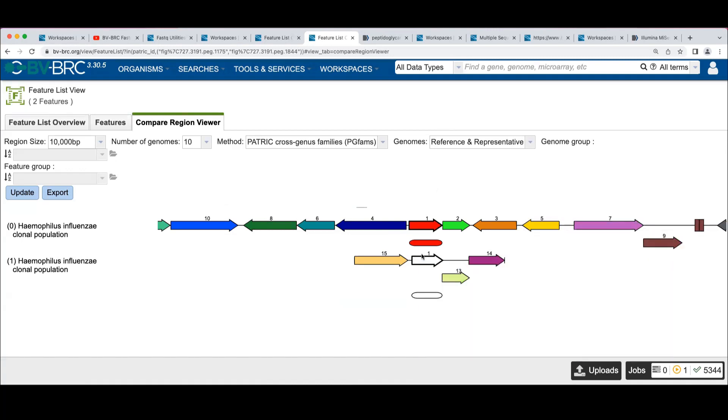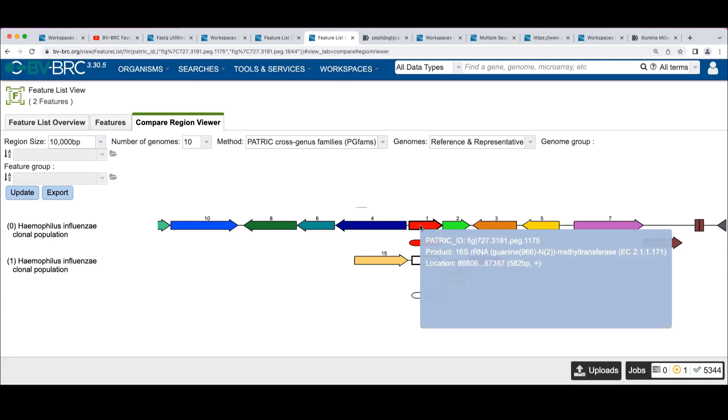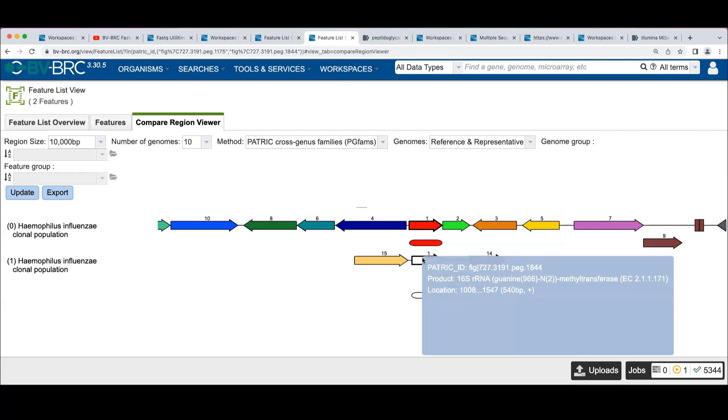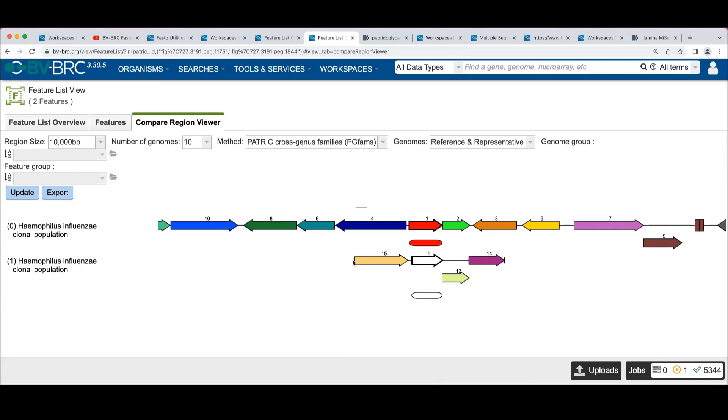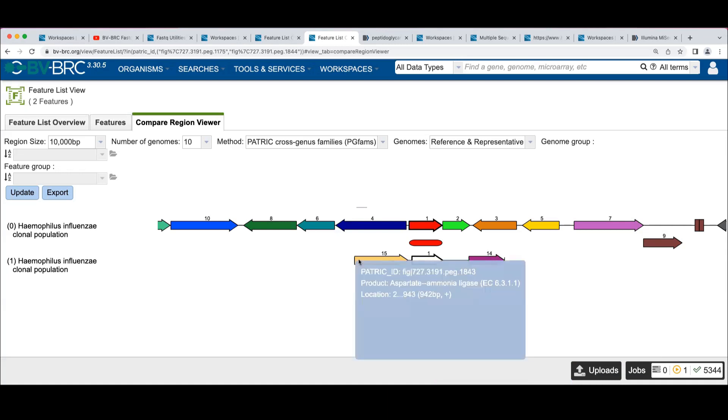And we see this first peg 1175. And then here's this other one. Notice it's on this short little contig, right? That you can see this little vertical bar here marks one end of the contig.